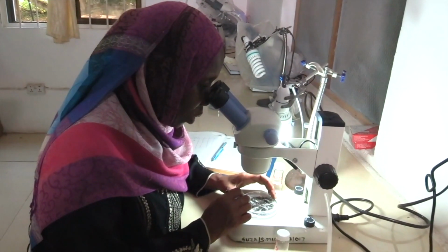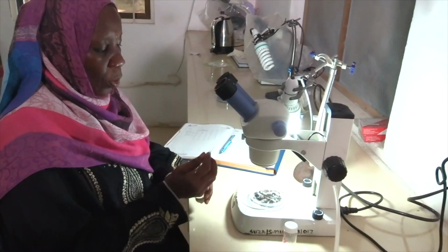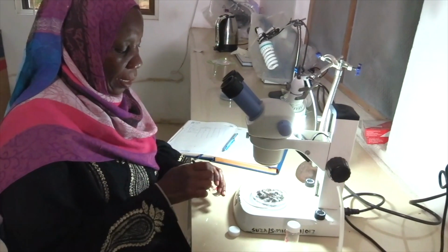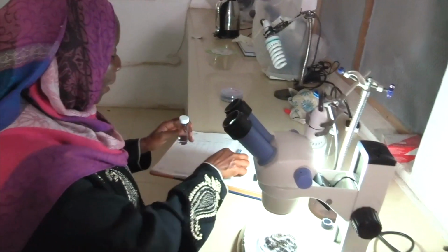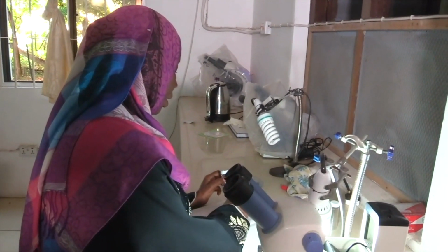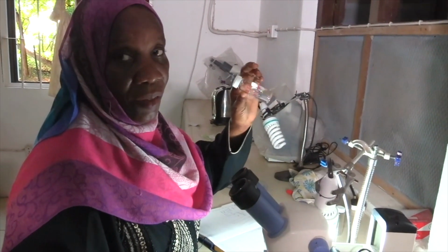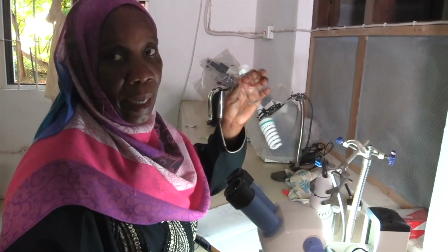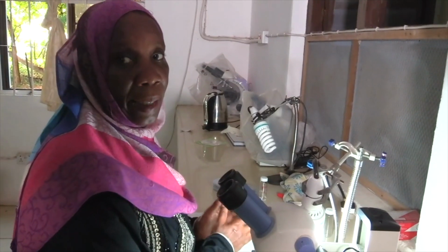You should put them here and count them. This is not a plastic, but this other one, white, this is a plastic also. You can put this here, and you turn again into the area where we put the white fragment. We have 1 thread here. So here we can find about 6 pieces of different sizes, shapes, and colors. Here we finish the microscopic analysis.